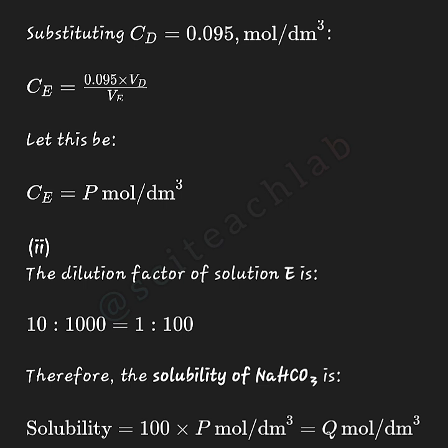If you used a 20 cm³ pipette, then VE is 20 cm³. If you used 25 cm³, you put 25 cm³, and then you calculate with the 0.095. If it was 0.095, yours could be 0.1. Whatever it is, times whatever volume of acid, all over whatever volume of base, will give you the concentration of the base in mole per dm³.